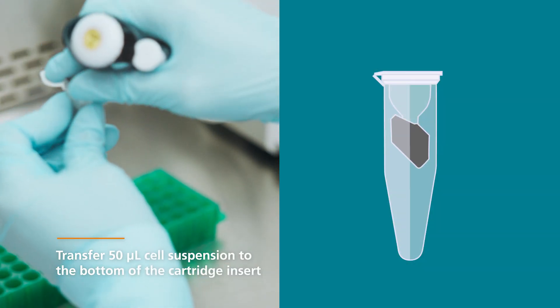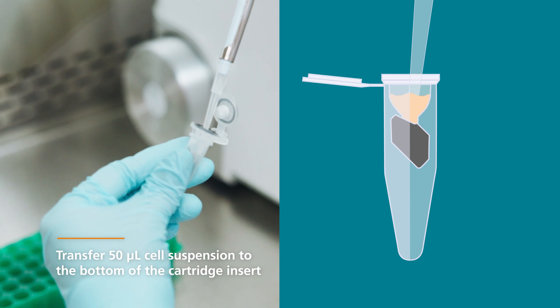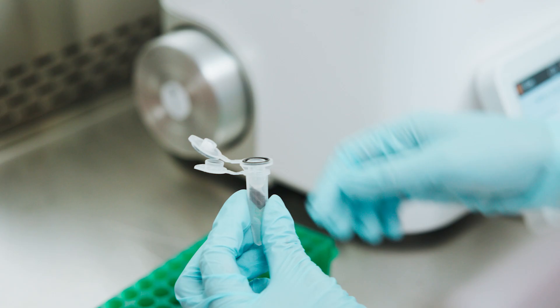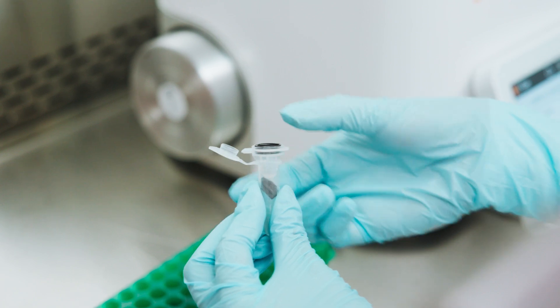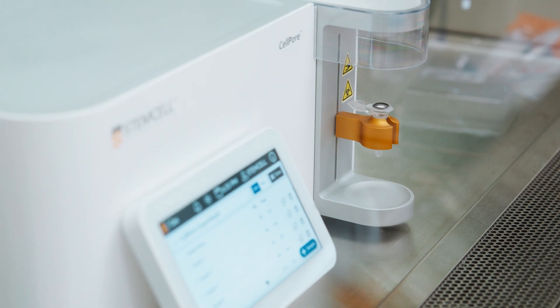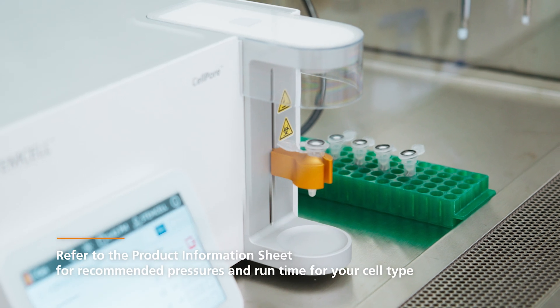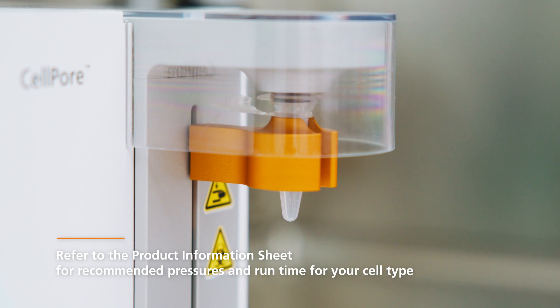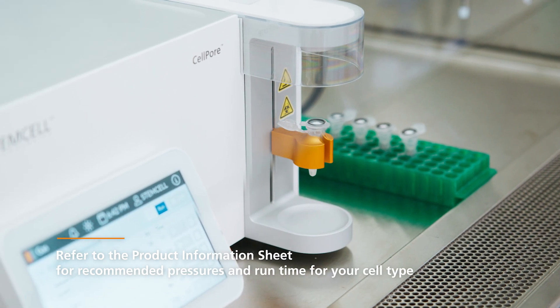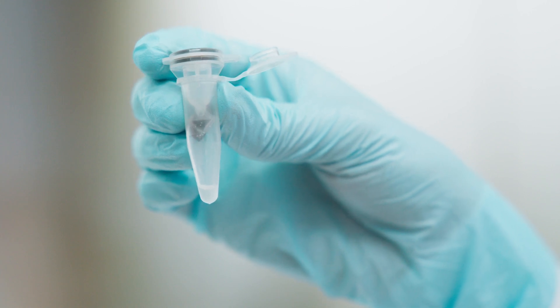Part 4: Running the samples. Transfer 50 µL of the prepared cell and cargo mixture to a new delivery cartridge. Insert the pipette tip all the way to the bottom and dispense. Close the cap of the cartridge insert and insert it into the arm of the CellPore instrument. Run the sample by tapping the Run button for the first sample programmed for 30 PSI. The instrument will apply the set pressure to the sample in the cartridge. Once complete, retrieve the cartridge from the instrument. The sample will be in the collection tube.